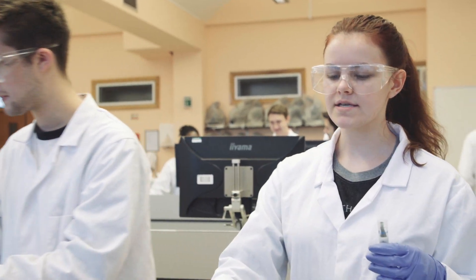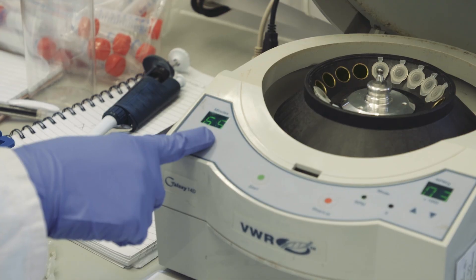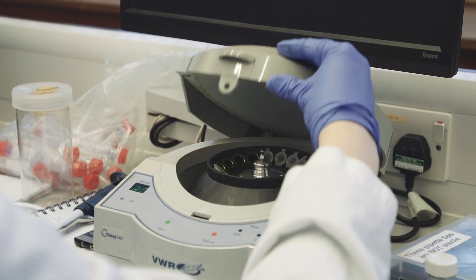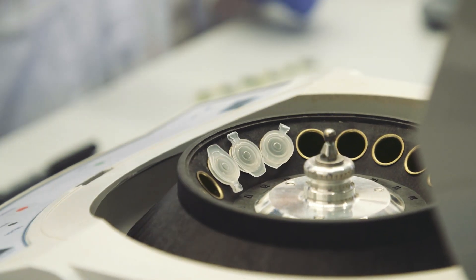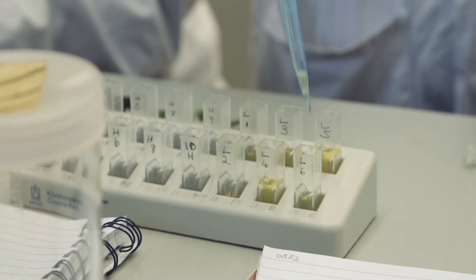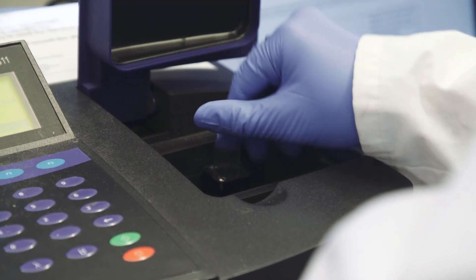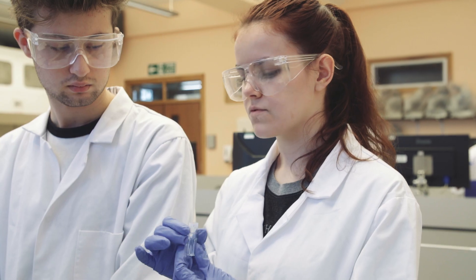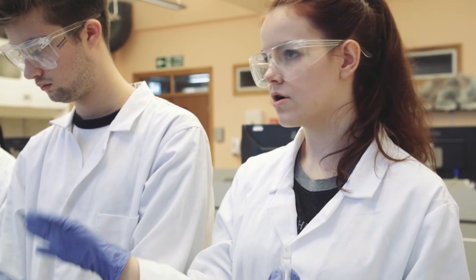We've centrifuged our samples so all of the pigments should be separate. Right now we're blanking this spectrophotometer to make sure that it's set to the right wavelength — you just put a blank cuvette in with just acetone in it and that will just pass all of the light through, so then that's set.